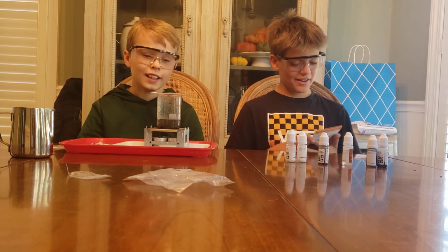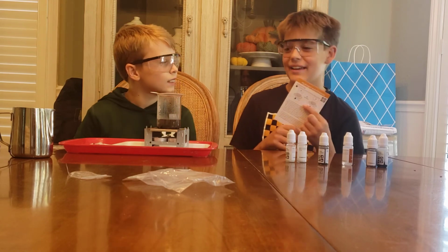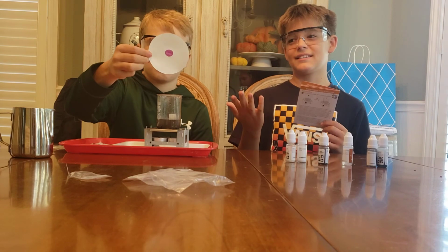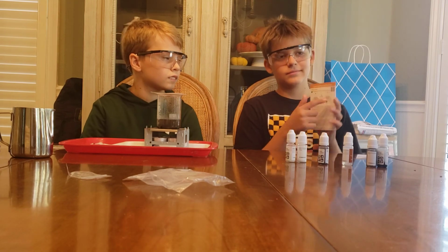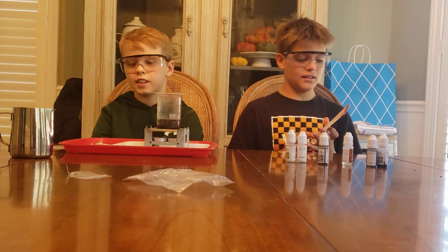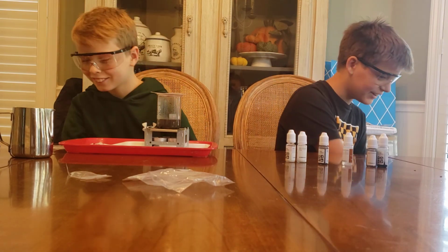Okay, so we might have done something wrong because it says it's going to turn yellow, but instead it turned purple. It stayed purple. It kind of looks way better than what it shows on the step. But that's going to be the end of our video. See ya. See ya.